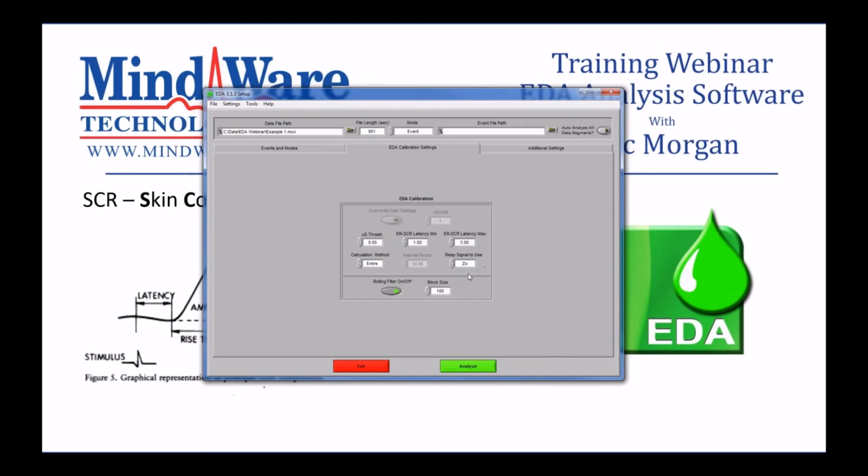The next setting we see is the resp signal to use. So remember, I mapped the impedance channels, and that's because we can derive the respiration signal from the impedance channels to use in conjunction with the EDA. And we're actually going to display that signal alongside the EDA signal, and we can use it to determine whether an SCR in the EDA is due to respiration, if it's due to artifact, or if it's truly a skin conductance response. I'm going to leave this at the Z0 channel, but if you had a rest belt or some other respiratory signal, you can choose that here.